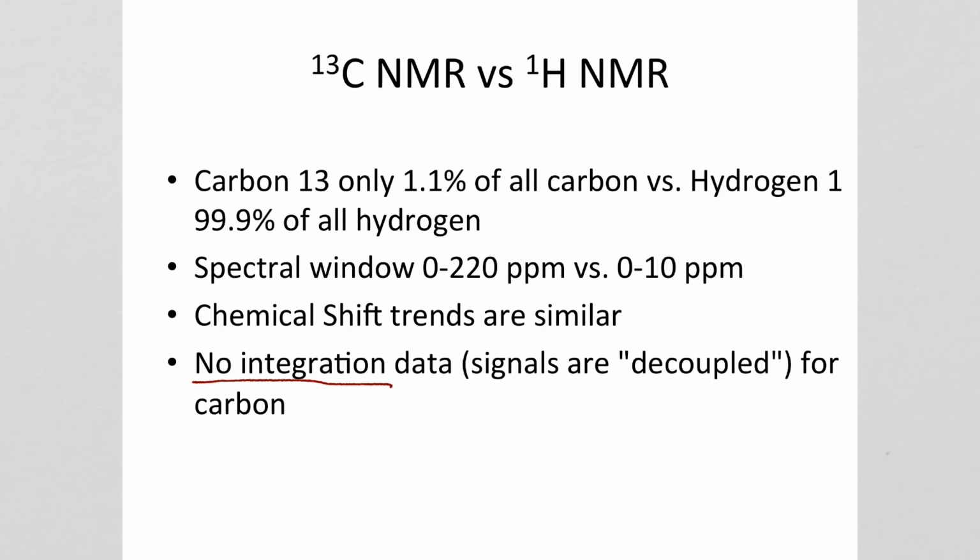In C13 NMR, you don't have any of what is called integration or splitting data. The signals are decoupled. Recall that in C13 we just see single peaks for each type of carbon that is present in the molecule.